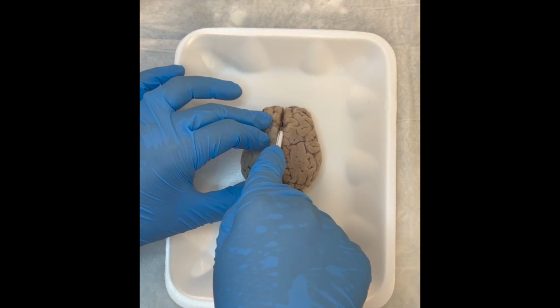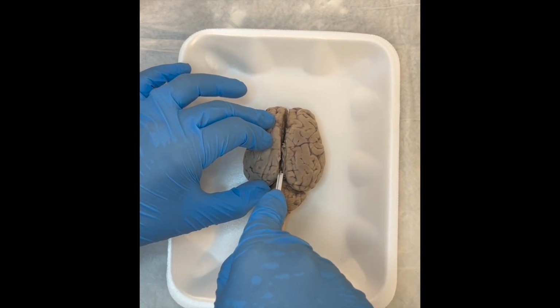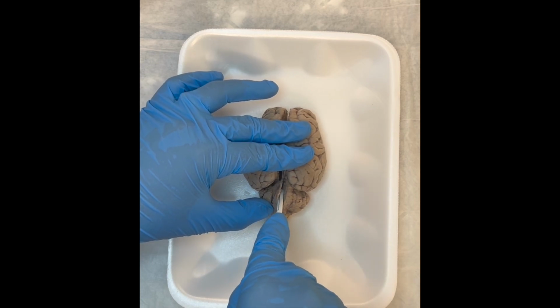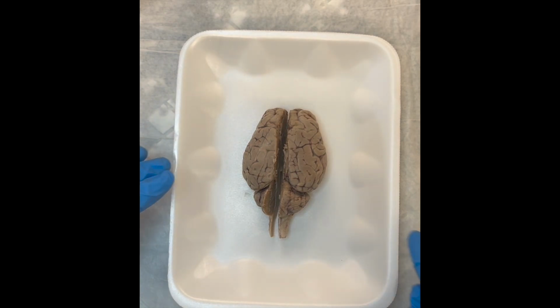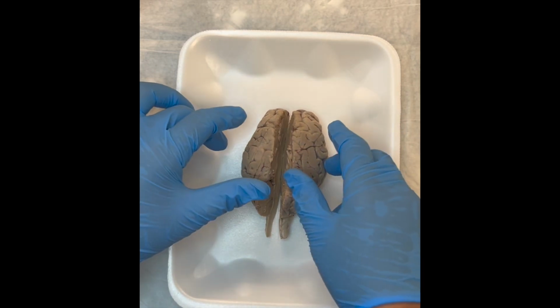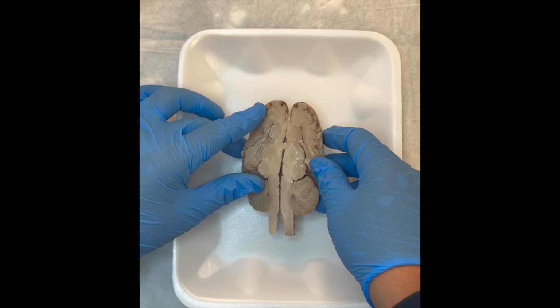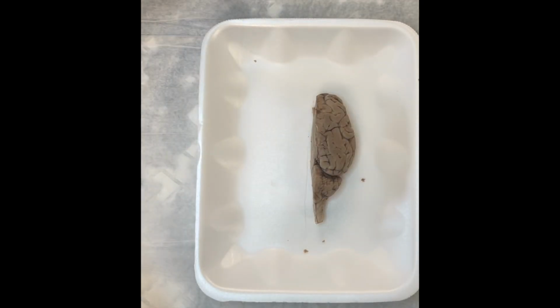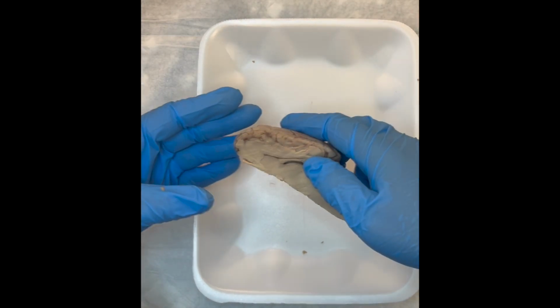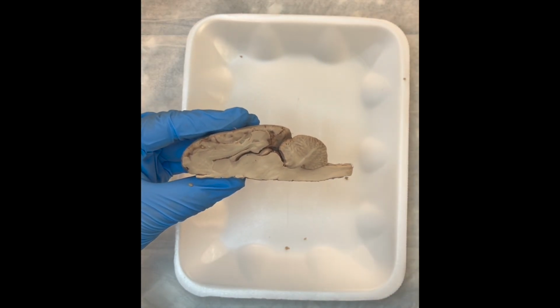I'm just cutting. The brain is quite soft, so you should have no issue cutting through. Nice and sharp scalpel blade, so that's pretty great. Then you just fold it open like this. You'll have a nice mirror image of the different structures. All right, so I'm going to use my right half here to go through the features inside of the brain.